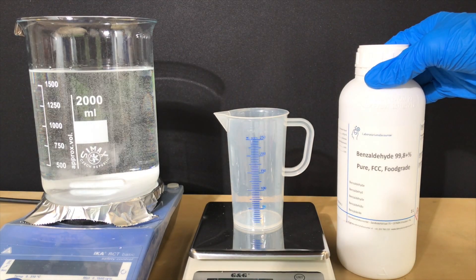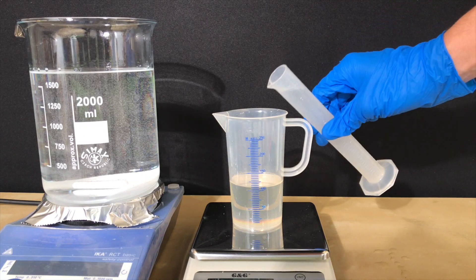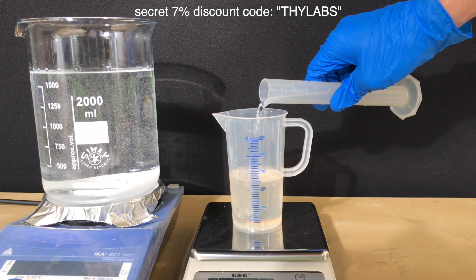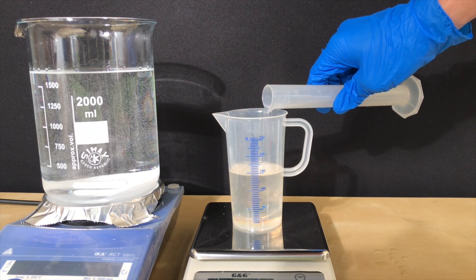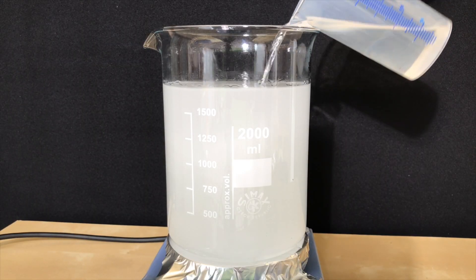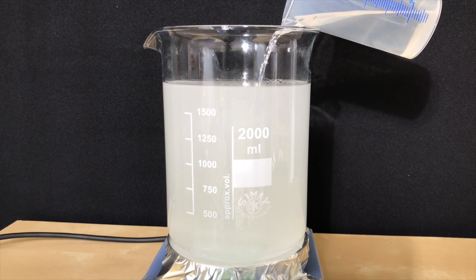I got my benzaldehyde from the Laboratorium Discounter, and if you want to order from them while getting a 7% discount, make sure to use the discount code shown on the screen. We added 29 grams of acetone to the benzaldehyde and swirled the cup to mix them. Under stirring, we added about half of the mixture to the sodium hydroxide solution. Keep in mind that all of this is done at room temperature — you should not heat it up.